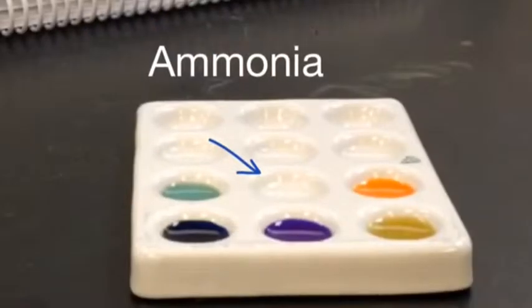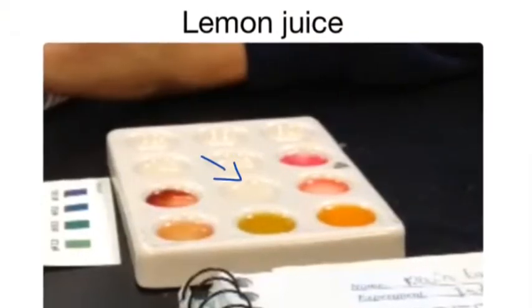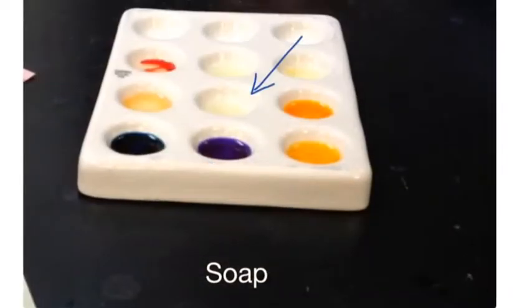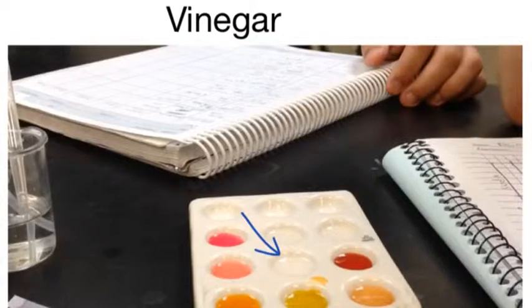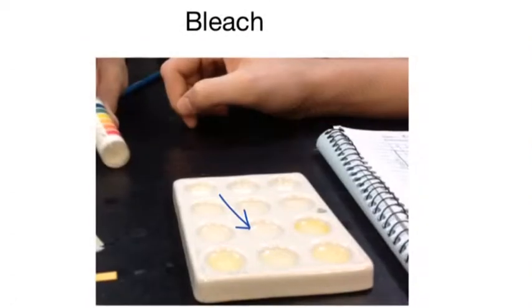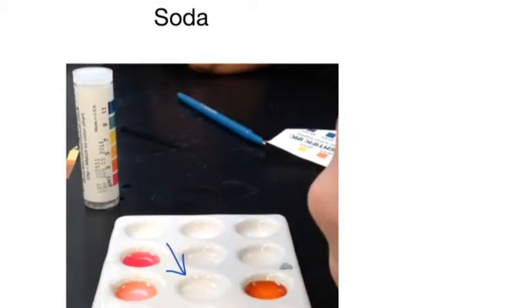When we put the litmus paper into the ammonia, there was no change in the color, meaning that it was a base. When we put the litmus paper into the lemon juice, it turned pink, showing that it was an acid. When we put the litmus paper into the soap, it turned blue, showing that it was a base. When we put the litmus paper into the vinegar, it was red, and there was no change, showing that it was an acid. When we put the litmus paper into the bleach, it turned white, meaning that it was an acid. And when we put the litmus paper into the soda, it stayed red, meaning that it was also an acid.